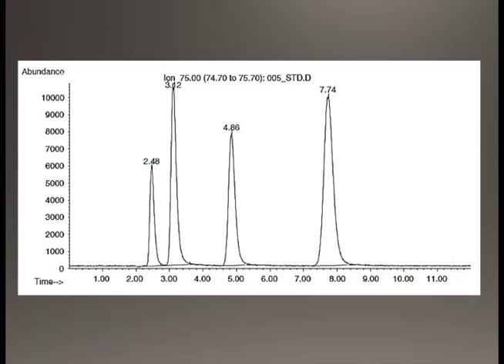And so their solution was to spike ammonium chloride solutions with arsenic species and see how they elute. And you can see here that all 4 of these species eluted before 8 minutes, while the chloride ion eluted at 9 minutes. And so here they concluded that chloride did not interfere with the arsenic determination by IC-ICP-MS.